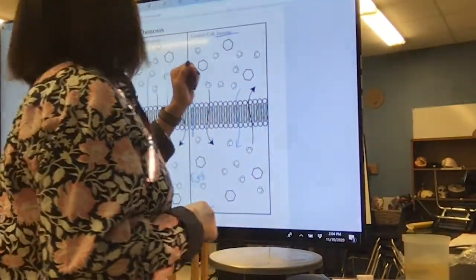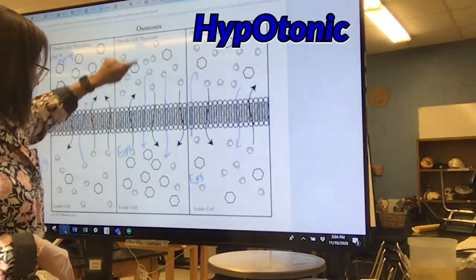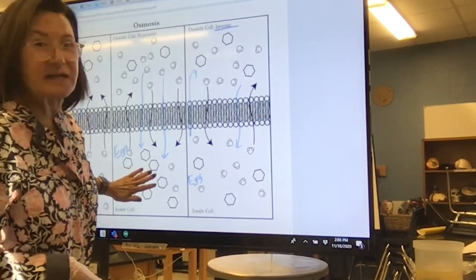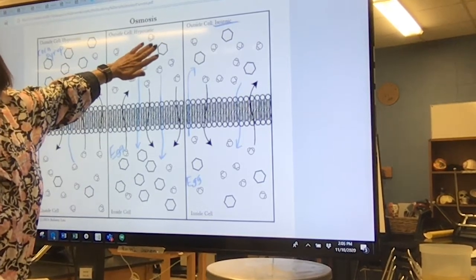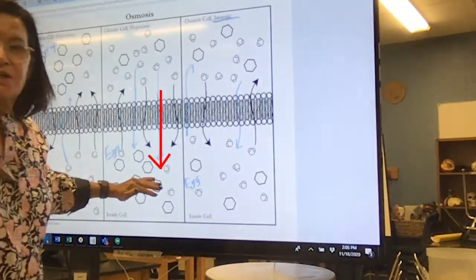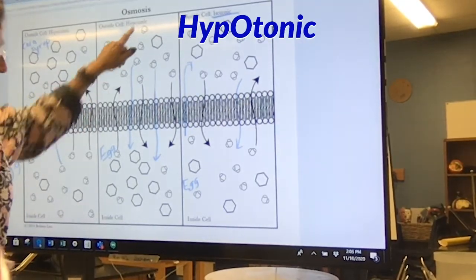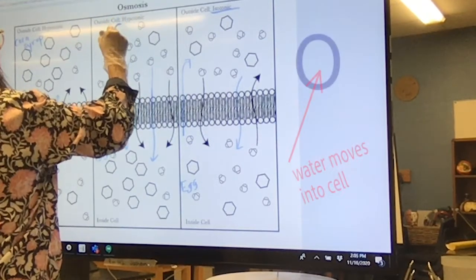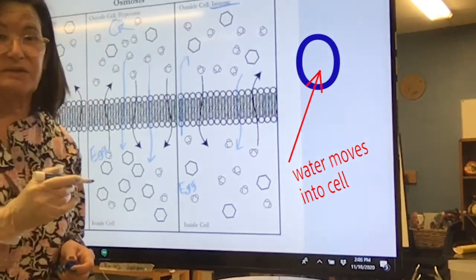And that was called hypotonic. So if we see, here's my egg, right? And there's not a lot of water in the egg at this moment. So when I put in the vinegar, so this would have been my vinegar, it would have moved into, you can see all these arrows pushing into that egg. So that makes it hypotonic. So a lot of times I think of this O in hypotonic as water going into that cell.